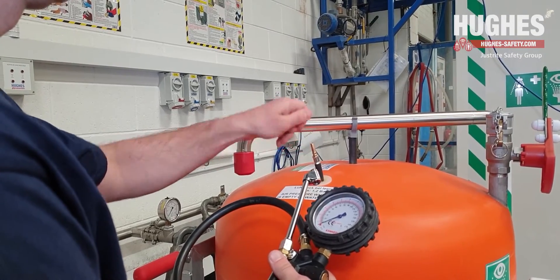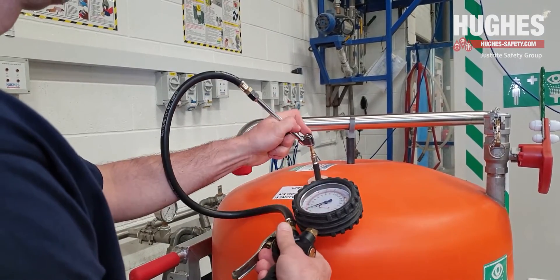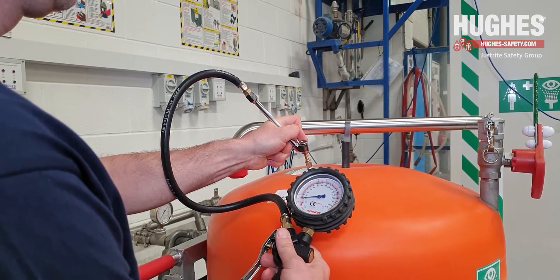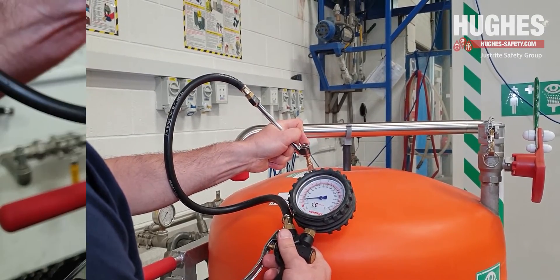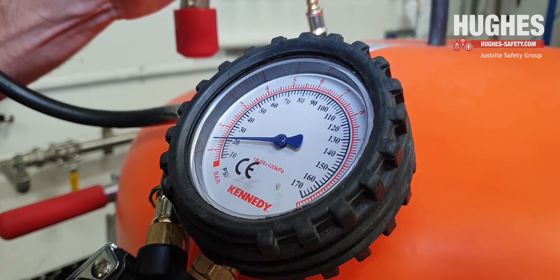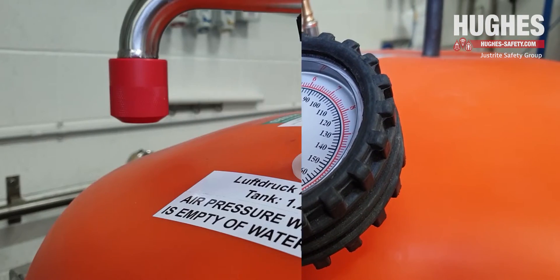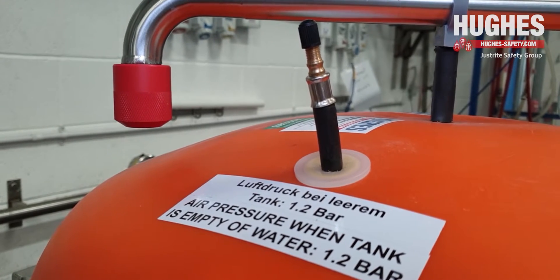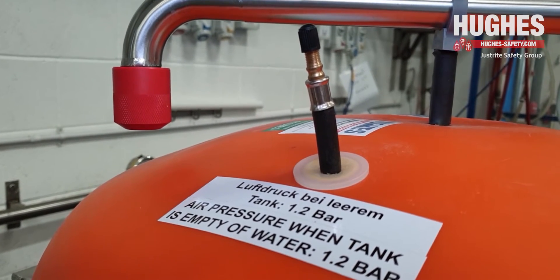Before you refill the unit, check the air pressure. This should only be checked when the unit is empty of water. If it is below 1 bar G, air should be replaced by pumping more air in through the Schrader valve fitted at the top of the tank. The nominal working air pressure of this unit is 1.2 bar G.